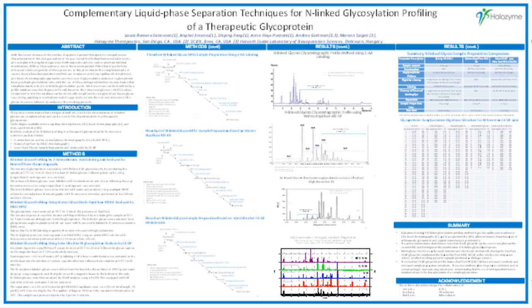The next question is, has an attempt at automating the sample prep been made? We have not yet, but that's what we intend to do. Actually at WCBP, I did attend the SCIEX seminar, and they had some great examples on automating this, using a robot and doing 96 well plates. So I know it's possible, and they have done it. Your best bet is contacting them and getting their presentation on that. We have not done that yet.